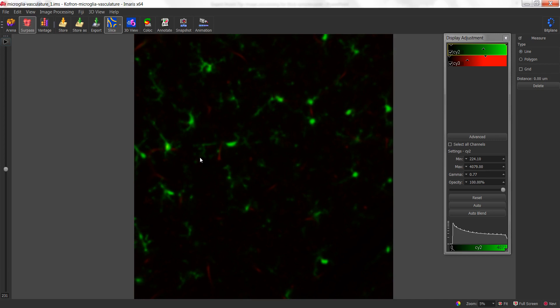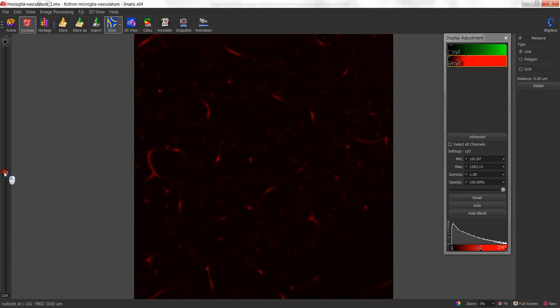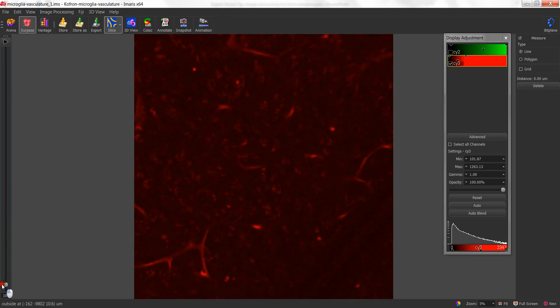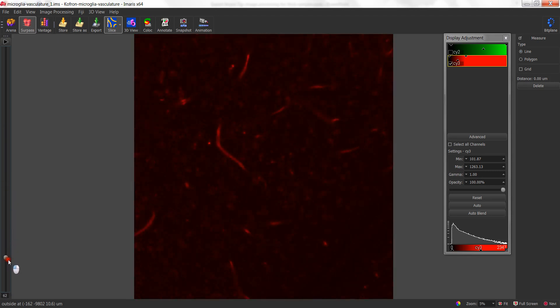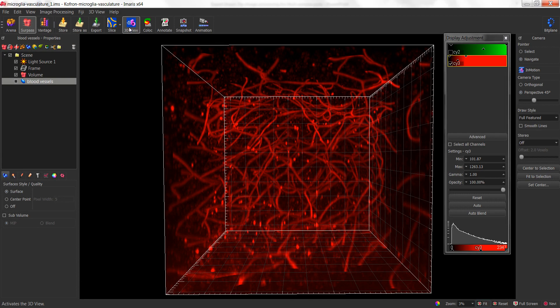Once the attenuation correction has completed, it will turn all of your channels on. I'm going to turn off the Psi-2 channel and focus in on the blood vessels. If I bring it down towards the bottom, you'll notice that all of the blood vessels look brighter, but so does the background. One thing to be aware of when applying an attenuation correction: it will amplify all intensity values, not just for the structures you're interested in. If I go up to the top, you'll now see that the intensity at the top and at the bottom should be more similar. I'm going to switch to the 3D view to see the z-axis visualization, which will indicate we now have a consistent intensity throughout the volume.